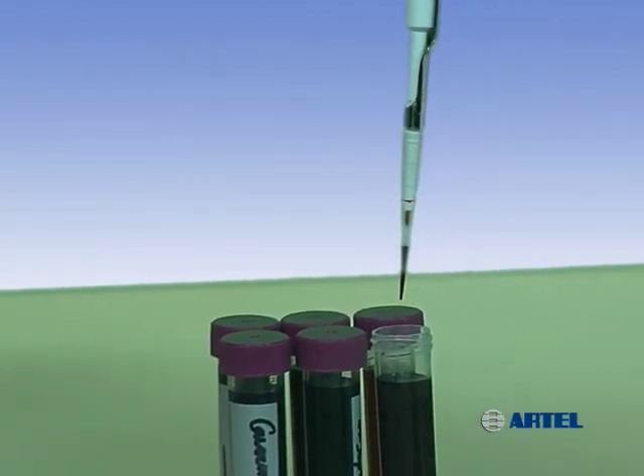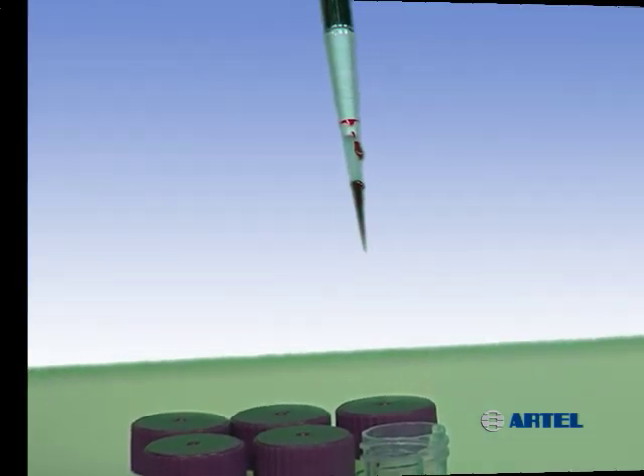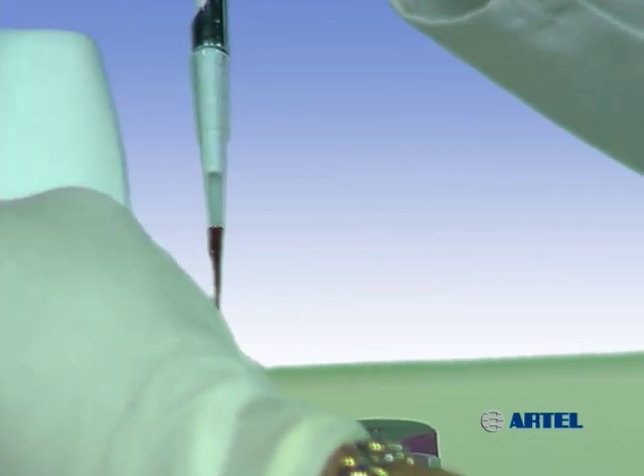After aspirating a liquid, droplets can sometimes be seen on the outside of the pipet tip. In this case, it may be appropriate to carefully dab the droplets with a lint-free cloth.